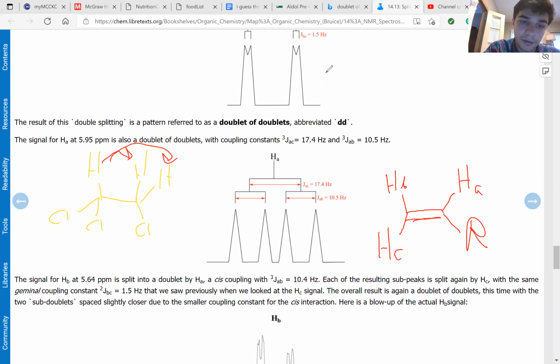And we know that the two equivalent hydrogens would couple with the singular neighbor to make a doublet, right? This is basic NMR. Both of them will do it. So you'd have an integration of two versus an integration of one, but the splitting pattern would be a doublet. And this is all stuff y'all have learned before in the basic NMR.